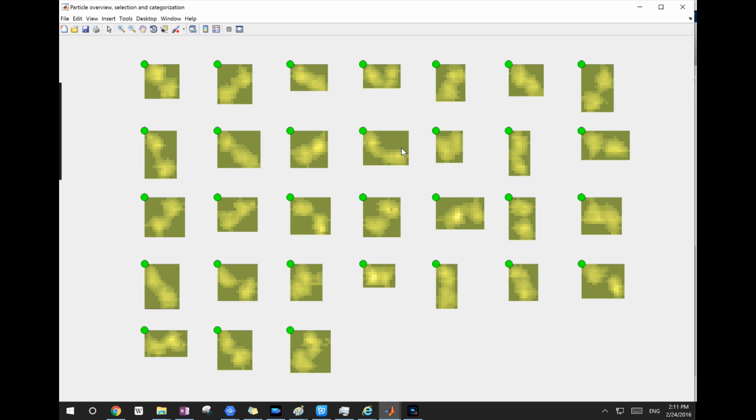And if they are in the same shape, this is especially useful if you want to categorize particles by shape, because right now basically what we're doing is we blow them up. We want to check their alignment, check their shape, and when they really match up well with one another, especially when you do correlation analysis, you got the correlation coefficient there. So now we can do the category assignment. Just right click the particle, do a category assignment.